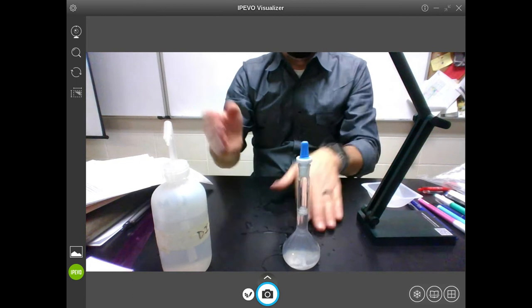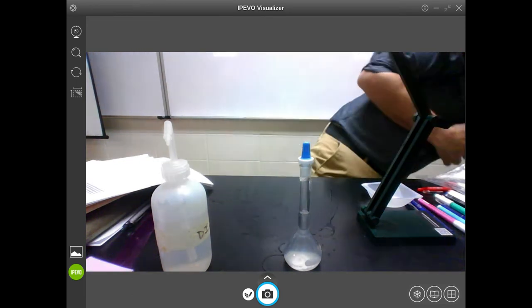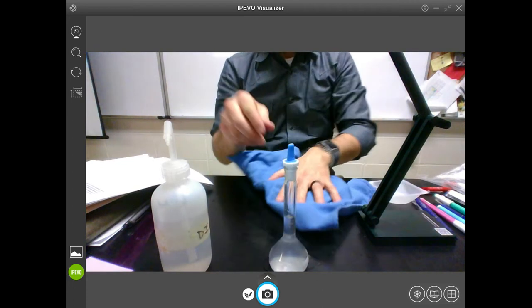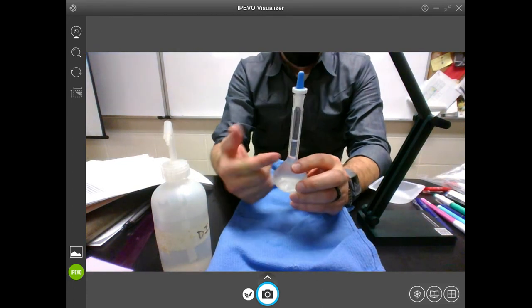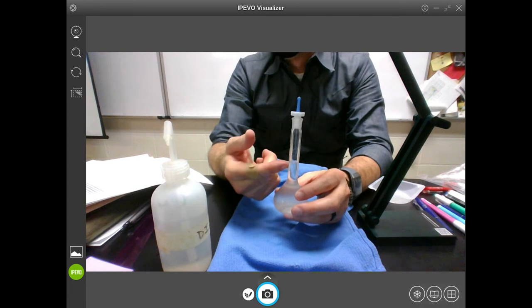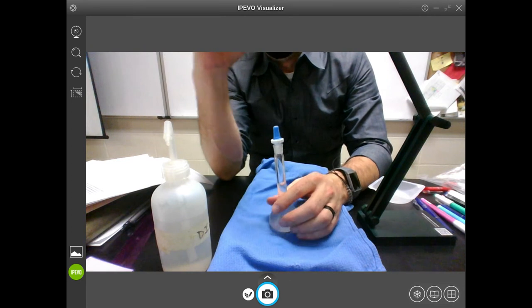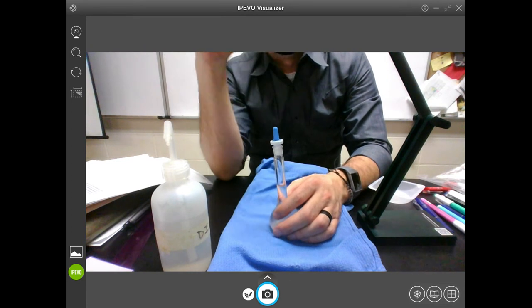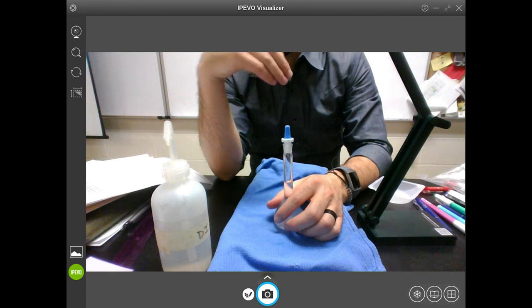Okay, and then you're going to transfer it. I'm going to have another chemical container for you to transfer it into and label. But once you hit that line, you know you have 100 milliliters, or this is a 50, but yours will be 100. You'll have 100 milliliters of whatever the molarity is you're looking for, because you know that with that combination of water and solid, that's the molarity that you were trying to get to. Does that make sense?